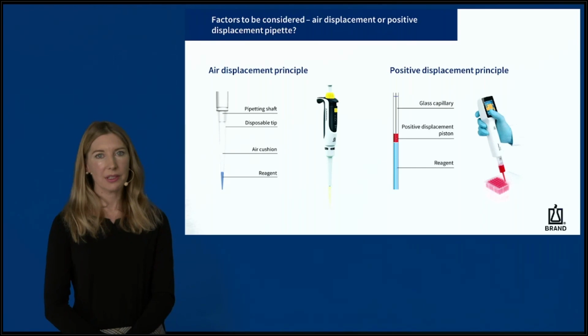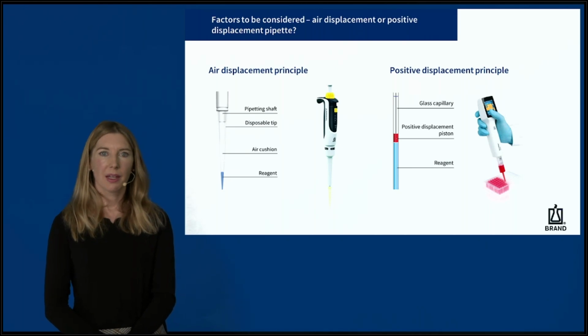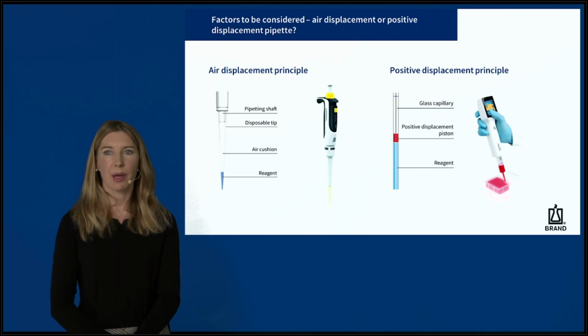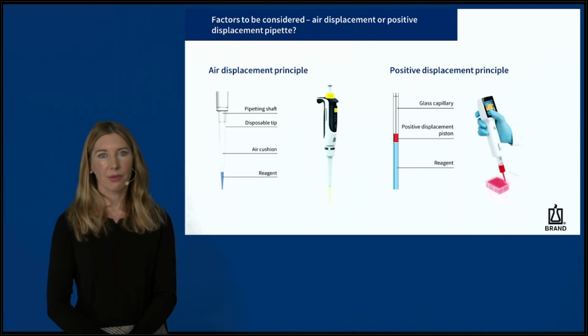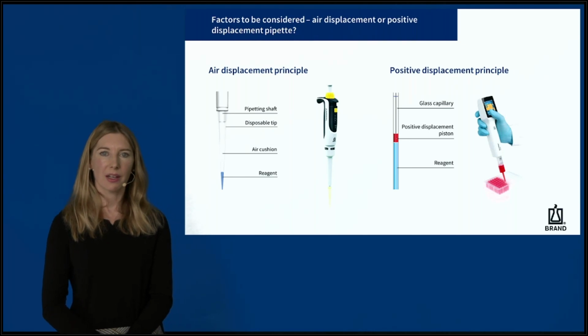The positive displacement principle is often used for repetitive pipettes, or specialized positive displacement pipettes. In contrast to air displacement systems, the piston of the positive displacement pipettes is in direct contact with the liquid to be dispensed. The piston aspirates the liquid through a vacuum and wipes the walls of the tip clean during dispensing, down to the last drop, which clearly leaves the tip. This principle ensures highly reproducible results regardless of the liquid and the influence of an air cushion.